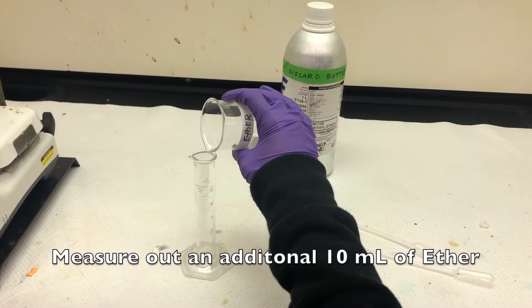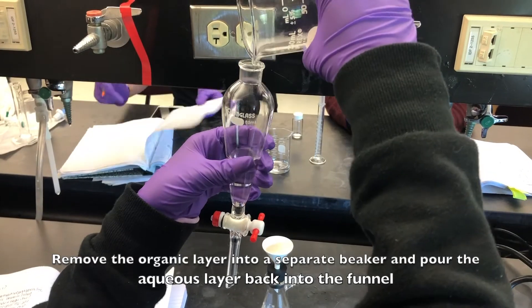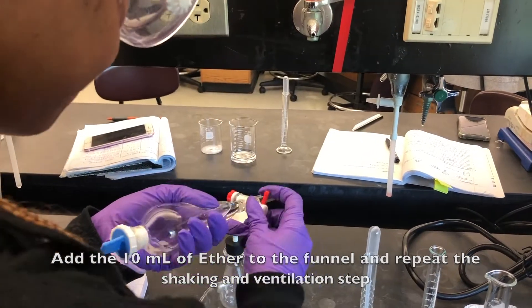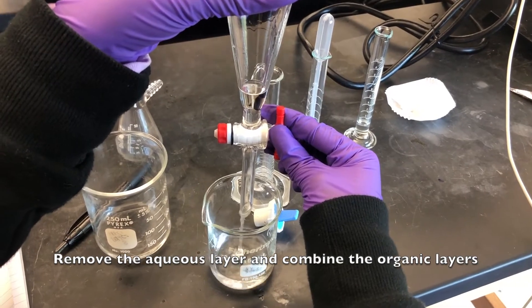Measure out an additional 10 milliliters of ether. Remove the organic layer into a separate beaker and pour the aqueous layer back into the funnel. Add the 10 milliliters of ether to the funnel and repeat the shaking and ventilation step. Remove the aqueous layer and combine the two organic layers.